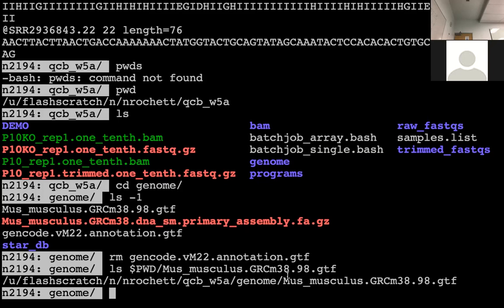Permission checking for path dot star exists and have permission to run. There. This is pwd. Just check where you are. Yeah, you're in my fresh place. Okay. So what you want to do is, once you have to go to your own directory. You have to go to one of your own directories. If you're in a non-own directory, you're able to see the files, but you're not able to create them.